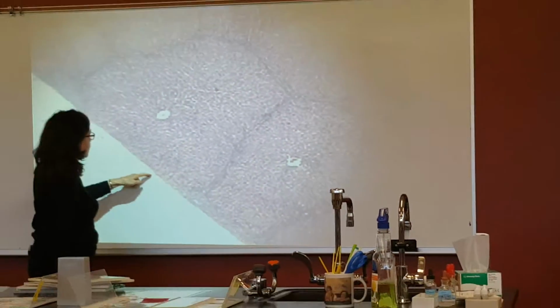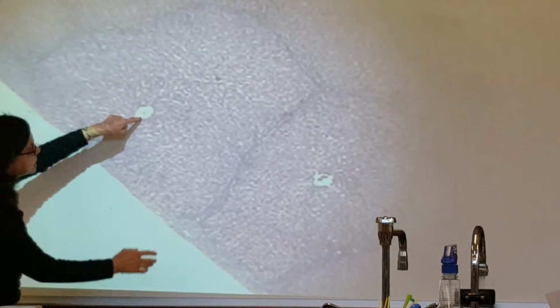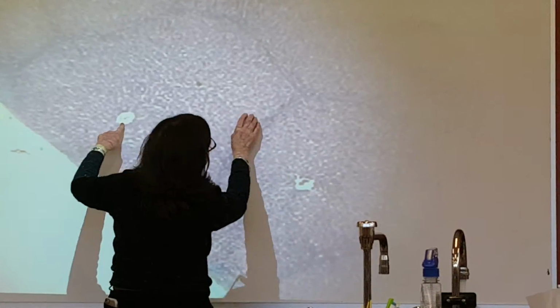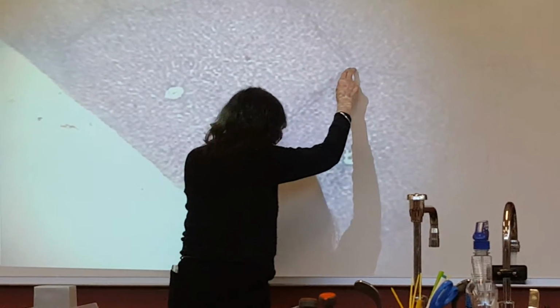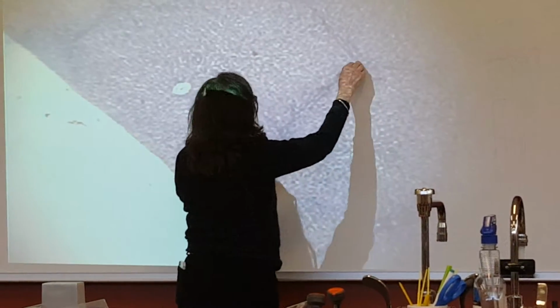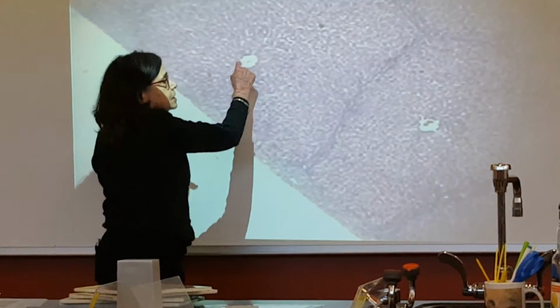So what we see here, the connective tissue that outlines the lobule, although it's cut off right over here, but you can see the lobule, right? And this is the central vein, which is going to get blood from, this almost looks like it's got some of those, like the artery and vein in here, and so this blood will percolate through to the central vein.